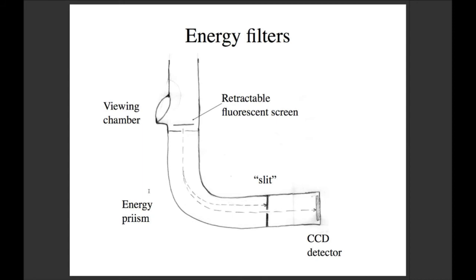I mean, the only reason why Gatan is using a post-column energy filter is because of the patents. They want to sell the camera with it. No, the patents. They can't break the JEOL patents. So the JEOL microscope company has the patents for in-column, the Omega energy filter. Okay, that's interesting to know. So the camera company couldn't use that patent, so they had to do it after the column.